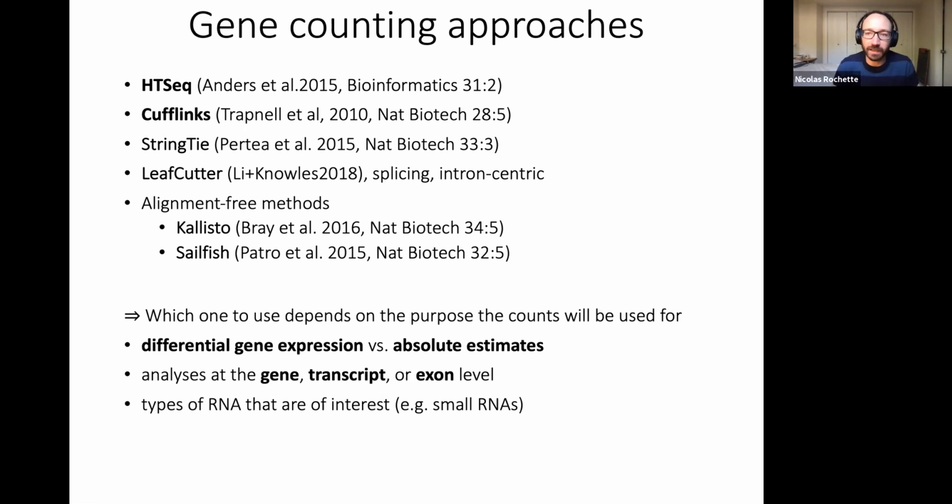The difference here is that when we have a gene, we're going to have multiple exons. We have our read alignments laid onto the genome, and the very simple approach is just tallying how many reads fall onto all of the exons of the gene. That gives us a figure for that specific gene, and we can do this for all the genes in the genome. That would give us a transcriptomic profile for that sample at the level of genes.